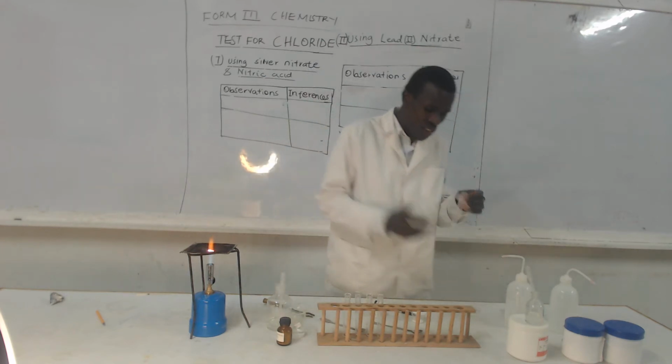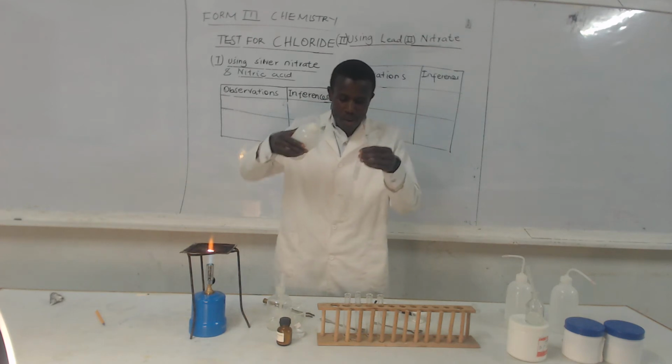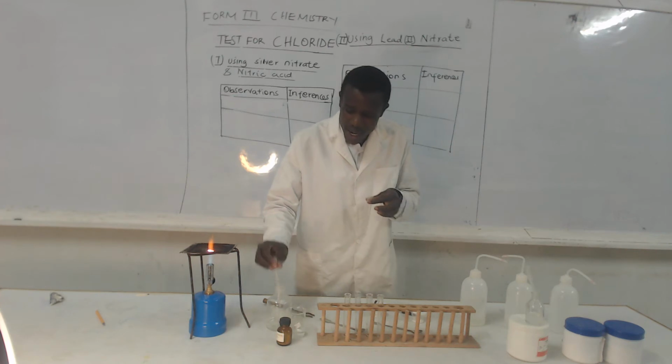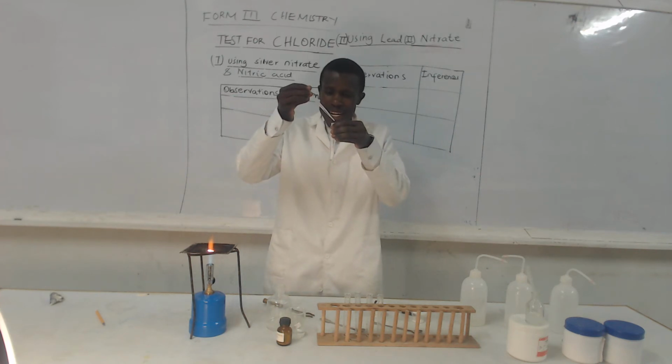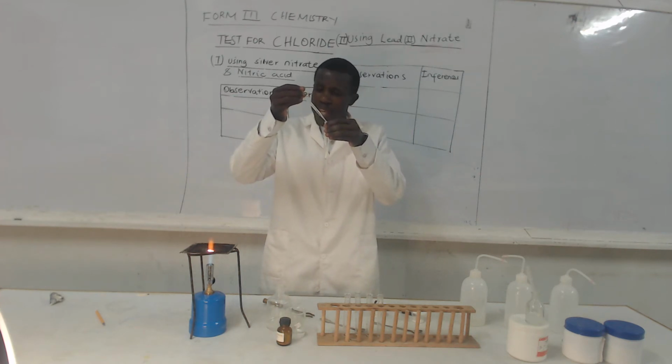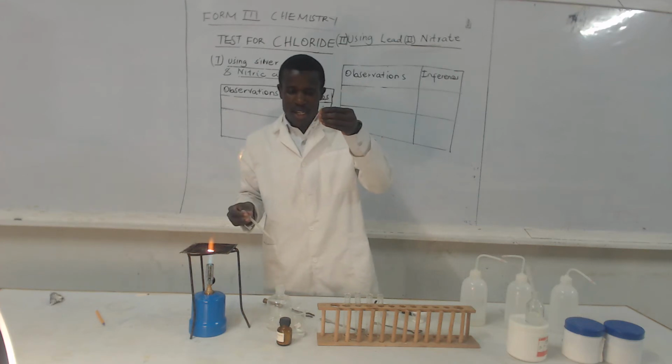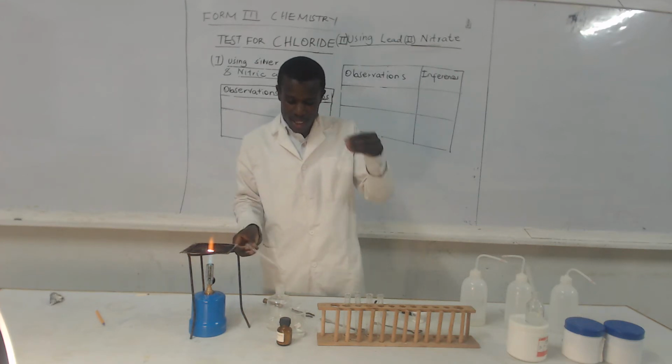You add distilled water to form a solution. After having done that, you add dilute nitric acid, whose major role is to eliminate an impurity.